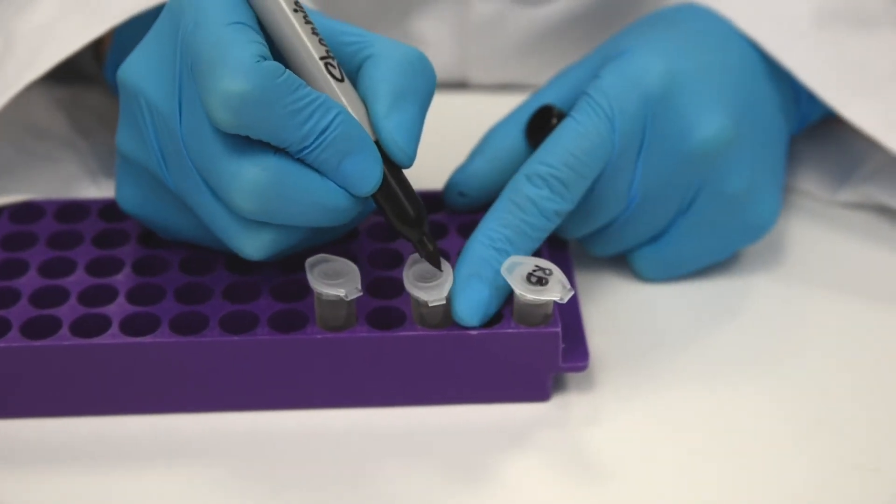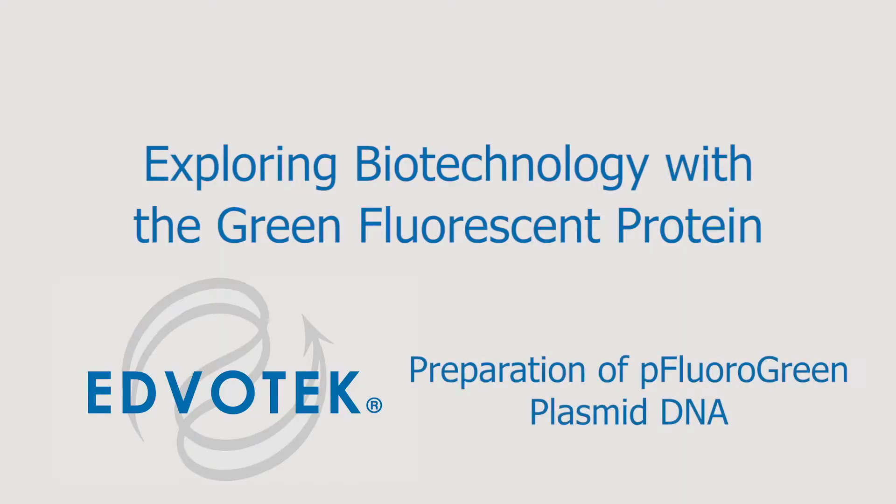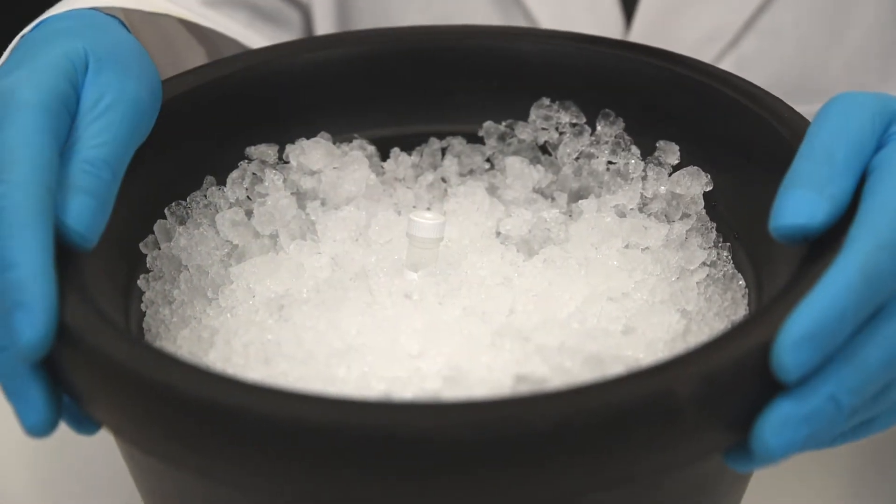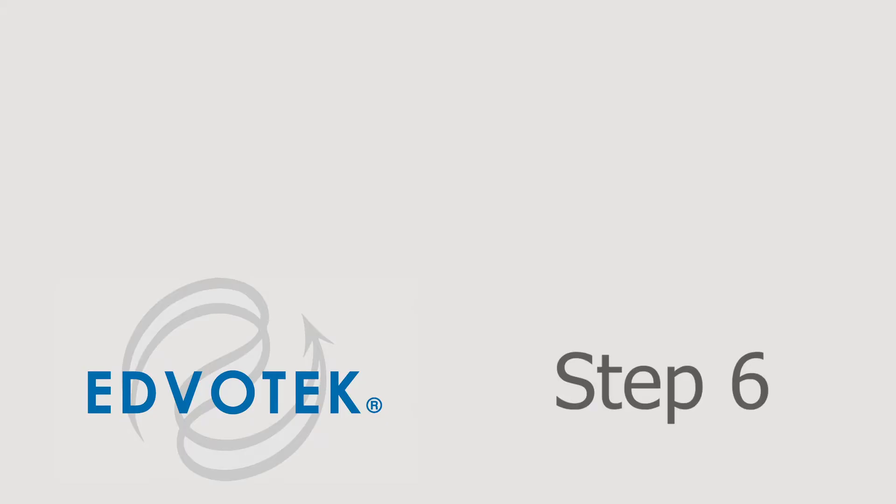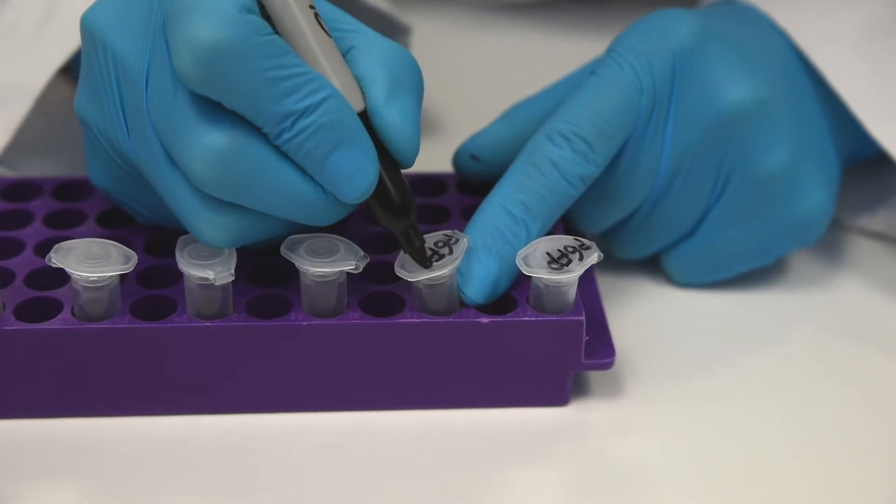Preparation of the pFluoroGreen plasmid DNA. Step 5: Place the tube of supercoiled pFluoroGreen on ice to thaw.